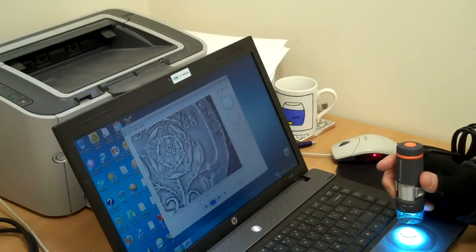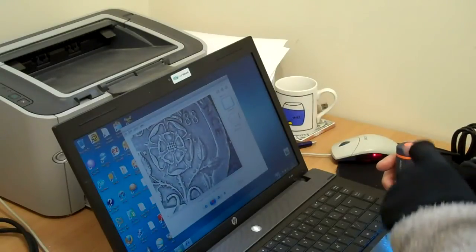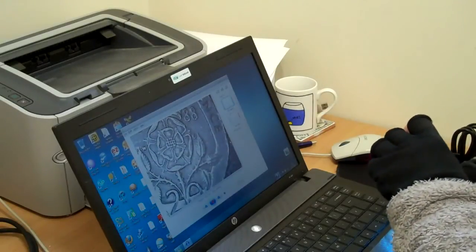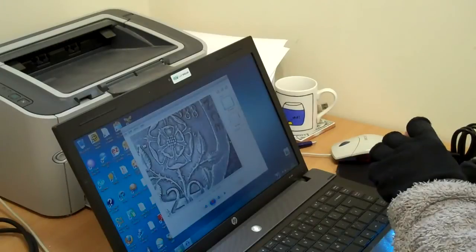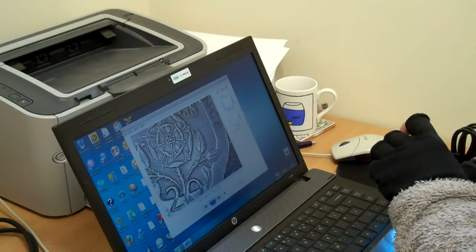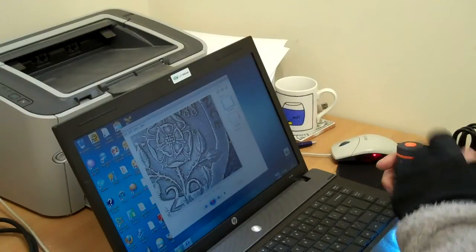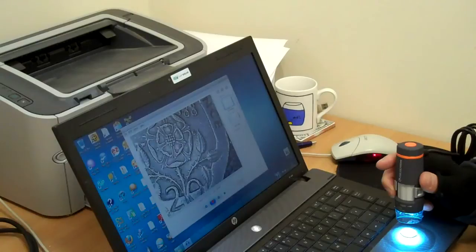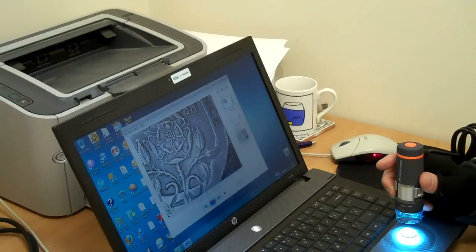If I want a picture of that, there's a little orange button on the top of the microscope. I'll just press that. It takes a snapshot.